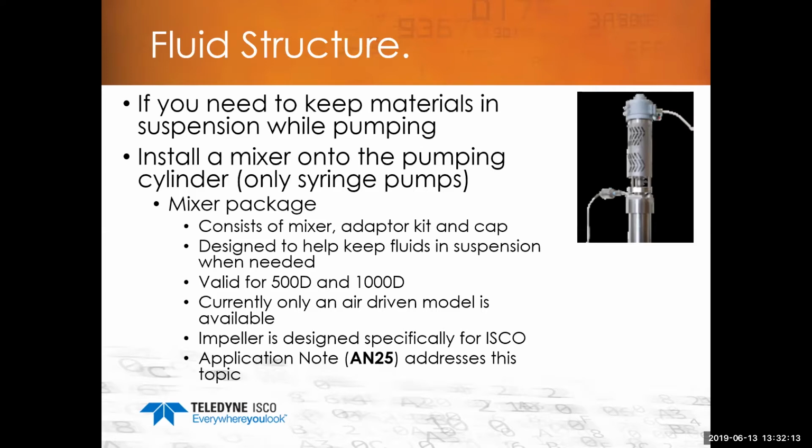And you can actually mix the fluids in the syringe because it'll create a continuous vortex that keeps the fluids in the state you want as it gets pumped in and pumped out. So this is a nice little option that you can use if that's something that might save you some dollars. Sometimes people use this method to combine some steps in the process.